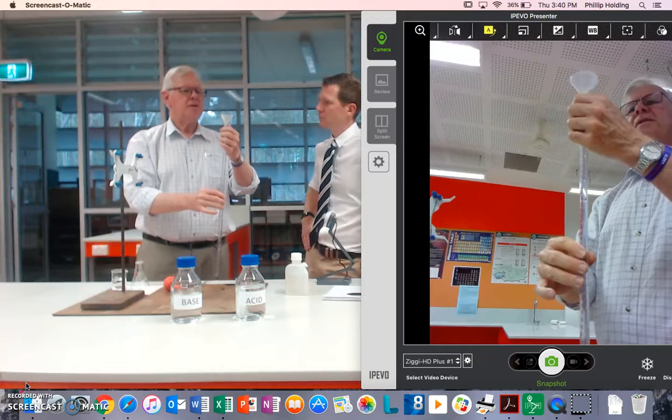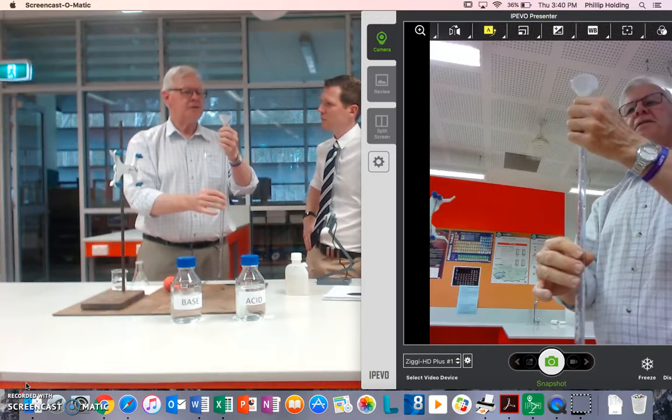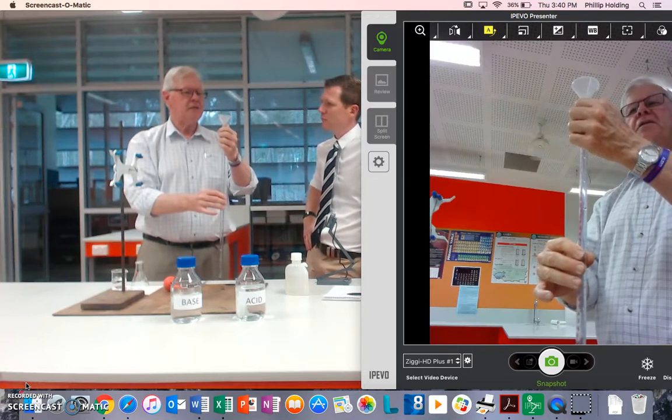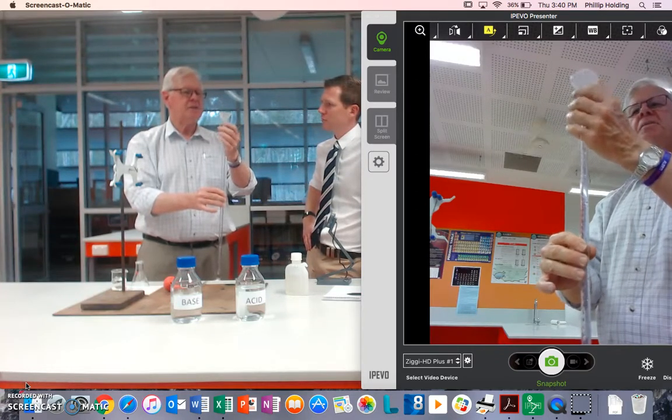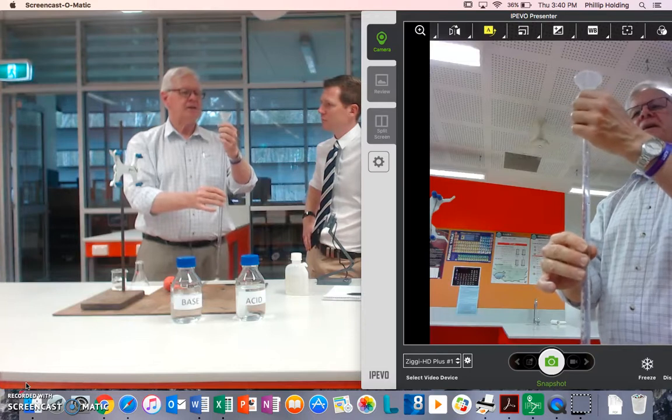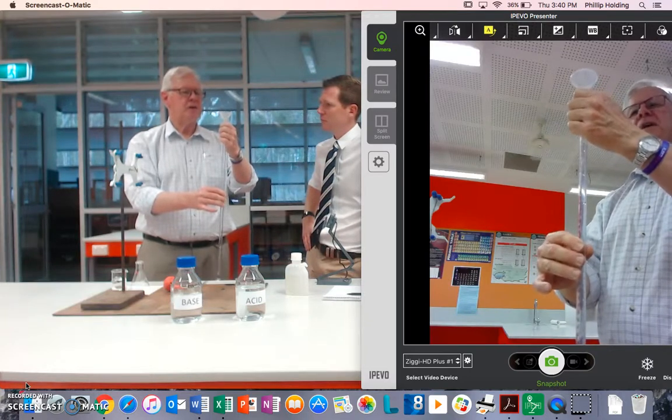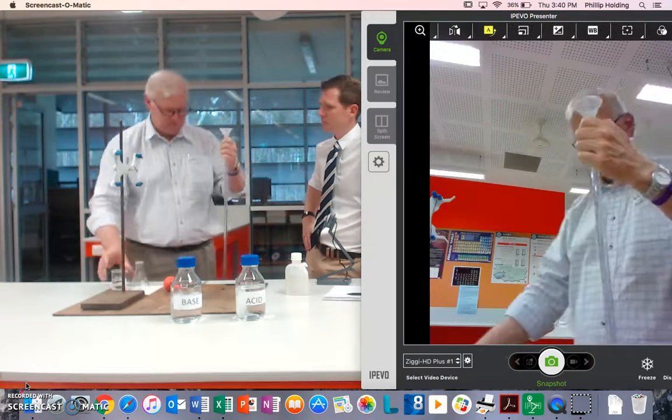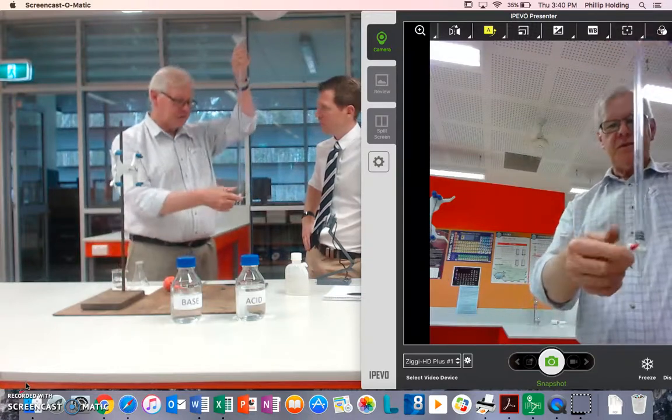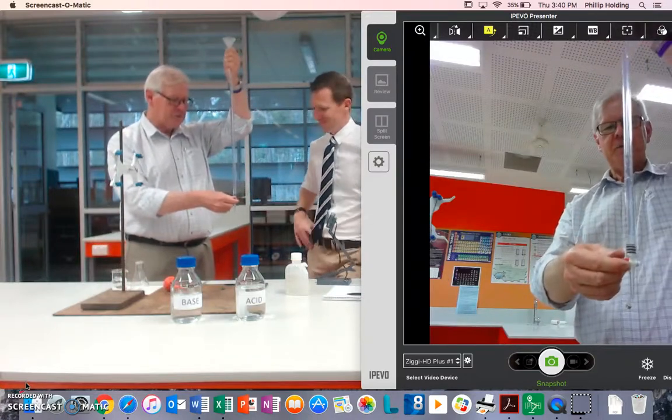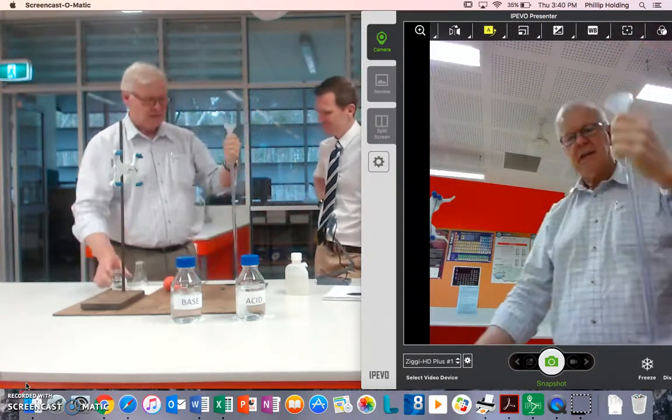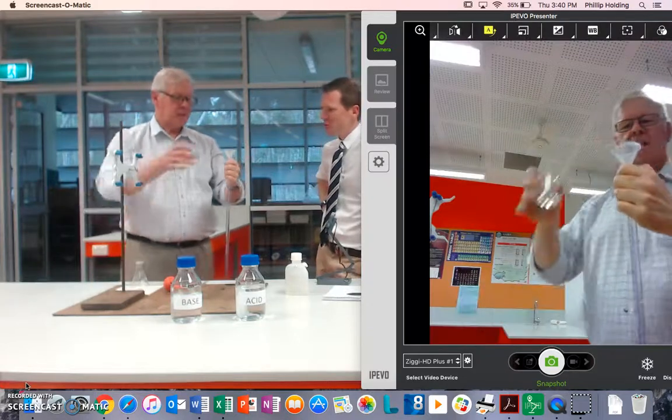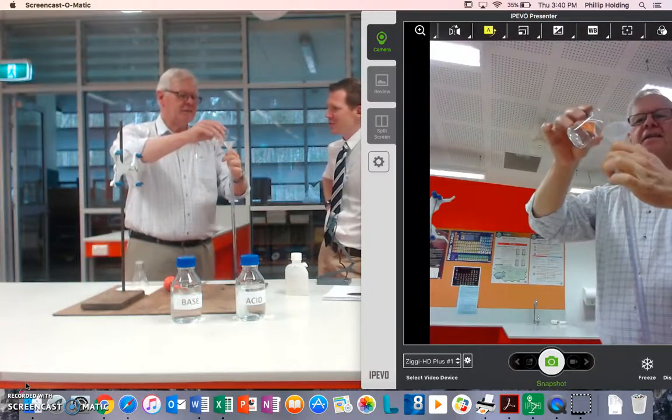With these, sometimes you've got to lift the funnel just a little bit to let the air through. Sometimes they seal at the top and they can gulp air. So I always just move that ever so slightly. Make sure the tap is turned off. You'd be surprised how many people have wet feet. It's not nice having base feet.